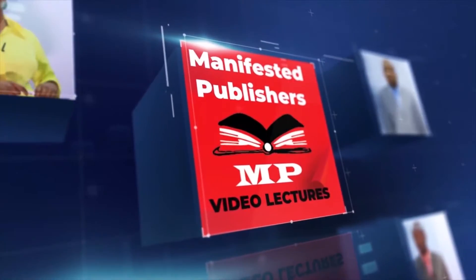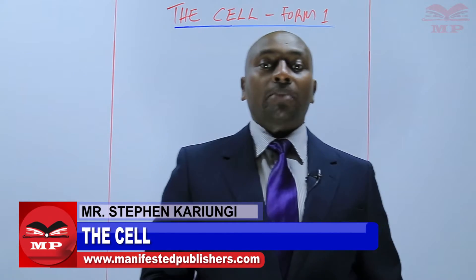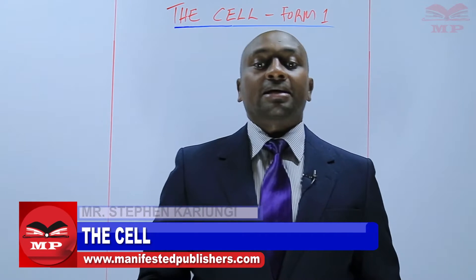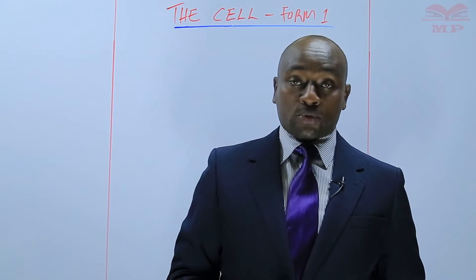Welcome to Manifested Publishers. Welcome learners, my name is Stephen Kariungi. Today we continue with Form 1 Biology and we are going to discuss the care and handling of a light microscope.